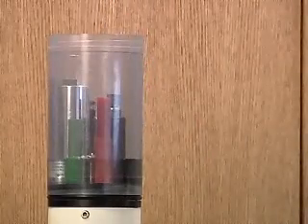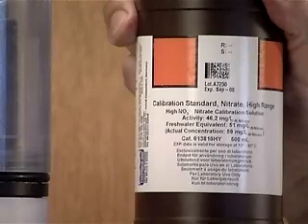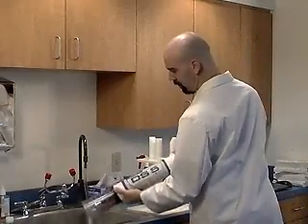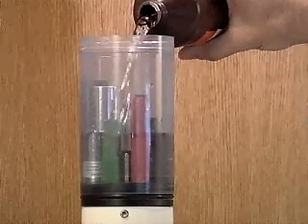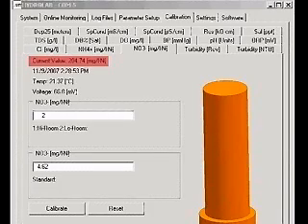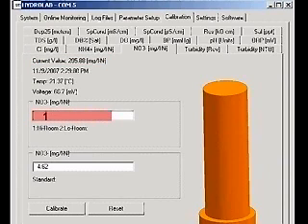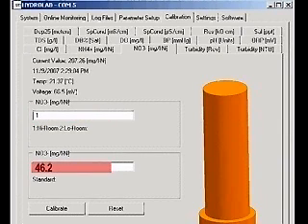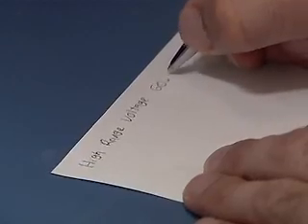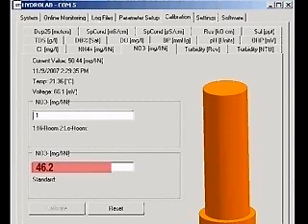Fill the cup about 25% with the Room Temperature High Standard and screw the storage cap on. Shake for 6 seconds. Remove the storage cap and pour the standard out. Fill the cup with Room Temperature High Standard again, this time covering the Ion tip and the pH sensor. Wait 5 minutes for the readings to stabilize. When the readings are stable, type a value of 1 in the first box to designate the high standard. Type 46.2 into the second box and click Calibrate. A calibration successful message will appear. Record the temperature and the voltage reading. Note, the value typed into the box is the Ion Activity, but the value appearing in the current value display will be the Ion Concentration.